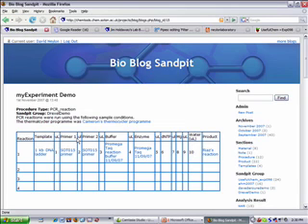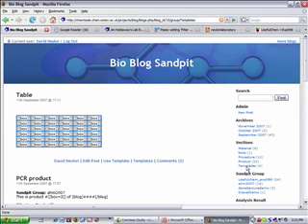We have an advantage in molecular biology in that a lot of the things we do are quite stereotyped. The procedures we use are very similar each time we do them. There's quite a large set of procedures, but nonetheless, each time you do any one of them, it tends to be about the same thing. So there's an obvious answer, which is that you have a template procedure which you work from, and then you just put in the material. But you can do slightly better than just a template you need to fill in.